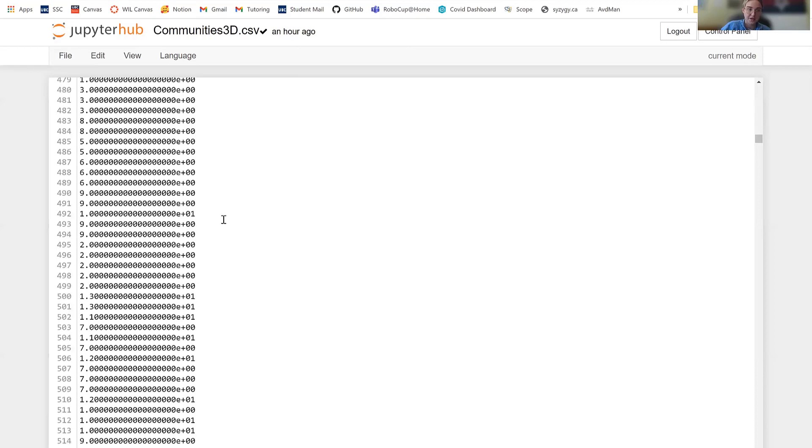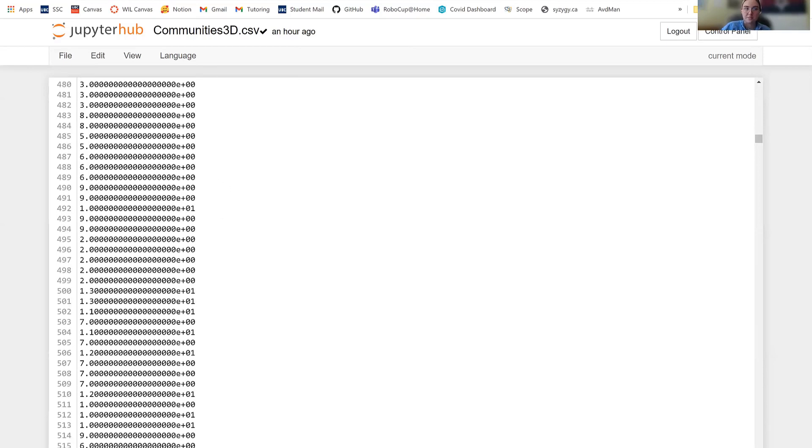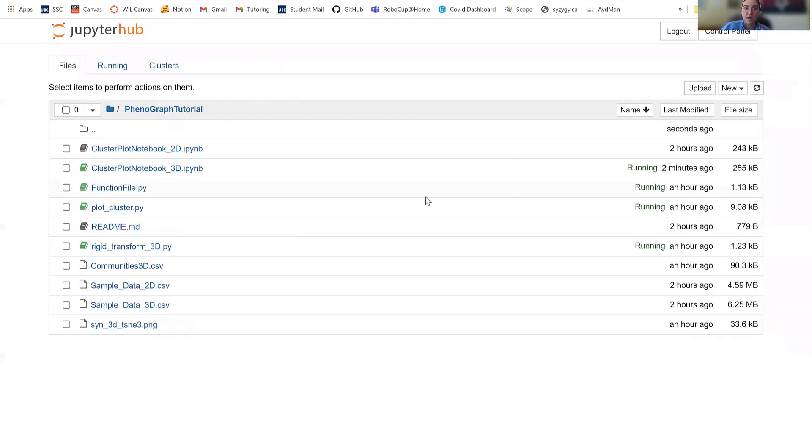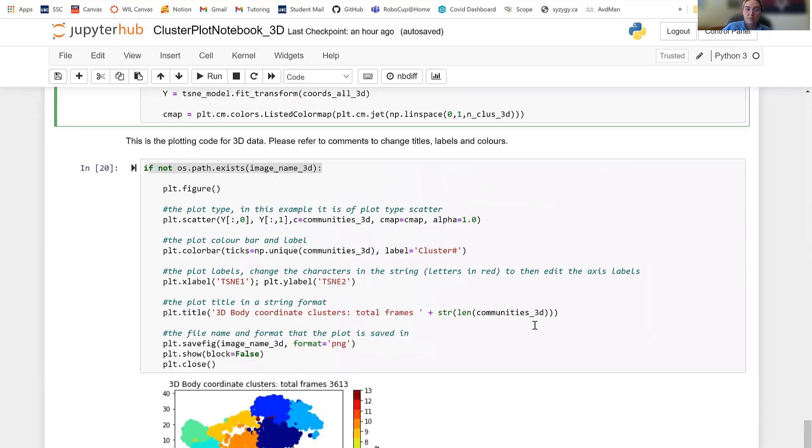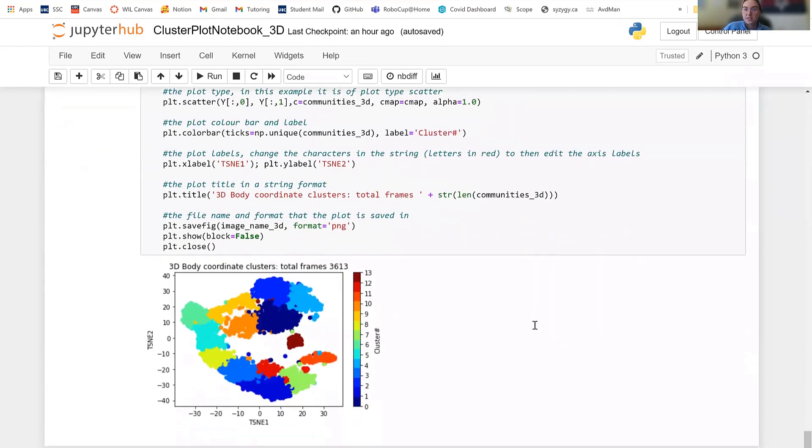But yeah, there's a basic run through on how to use the phenograph tutorial package. There is a 2D option. So be sure to use that if your data only includes two dimensions. And if you scroll through, each of the cell blocks has some explanation and read through the comments would be really helpful. And yeah, thank you so much for watching.